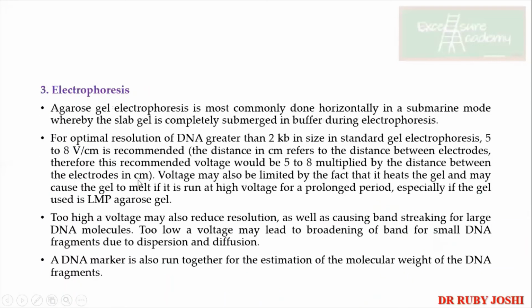Okay. Then electrophoresis already we have discussed. We don't need its unit dimensions. Just understand that your gel is made from Agarose and we are going to have a set of constant voltage over here. Okay? So this is how your apparatus looks like.